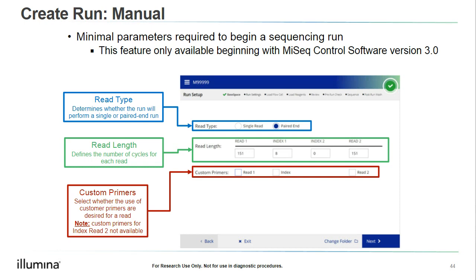You also have the option for loading custom primers here. Note that in this current release of the software, you do not have the option to select custom recipes. That may be introduced in a future update, but stay tuned to see what happens with that.